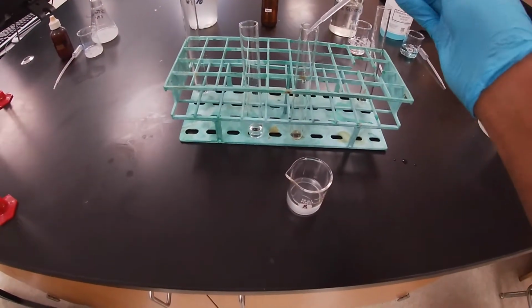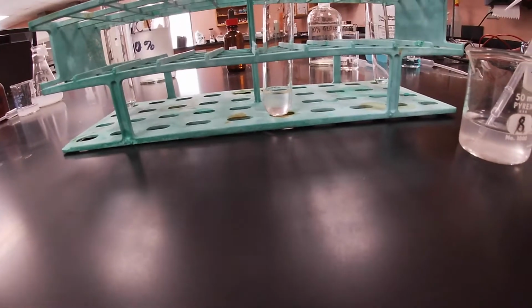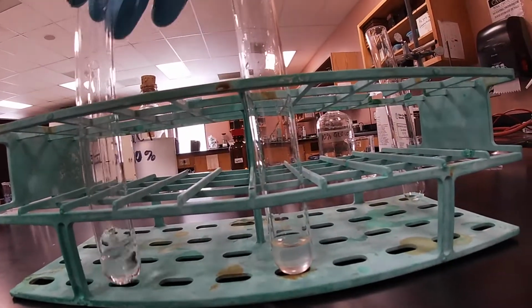So here we're going to pour out approximately 3 milliliters. So we're going to kind of eyeball it and make sure that it's about the same height as the test tube. And as you can see, pretty much the same height, right? So that's about 3 milliliters.